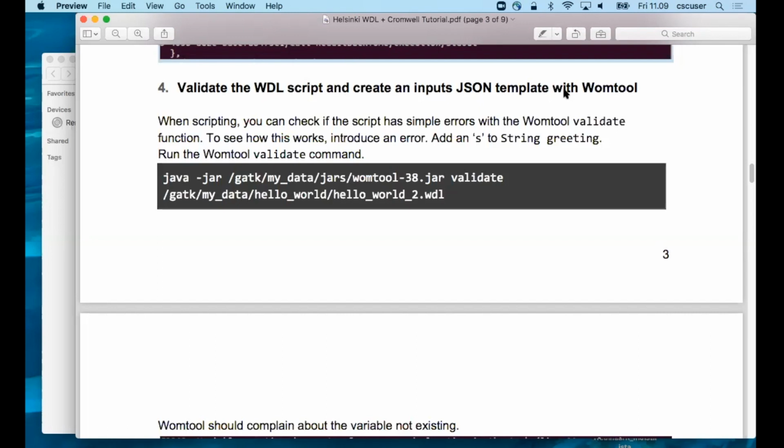This is fine. So you can get syntax highlighting and some line tabs.